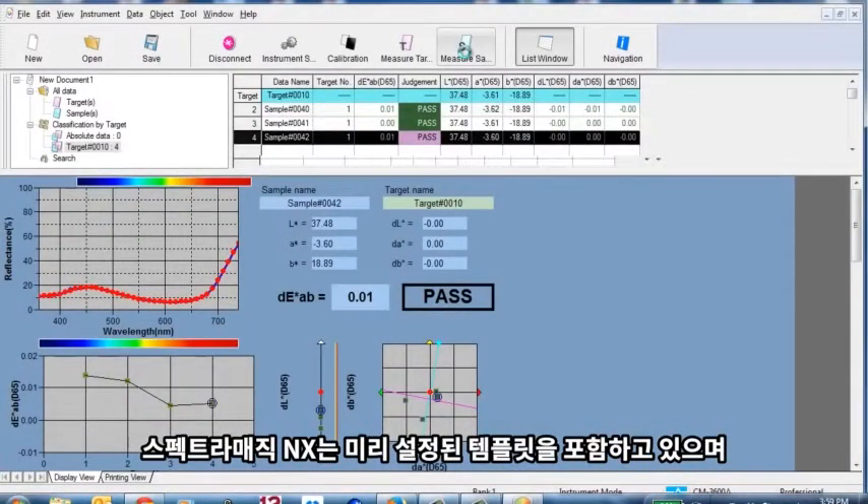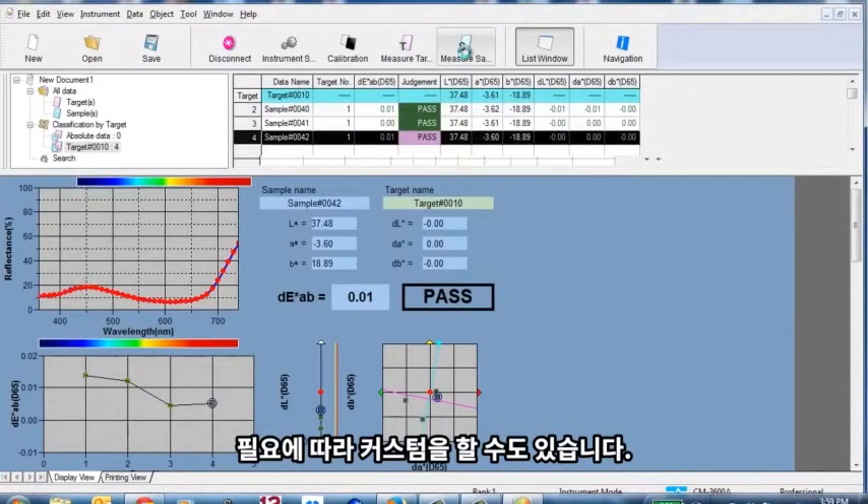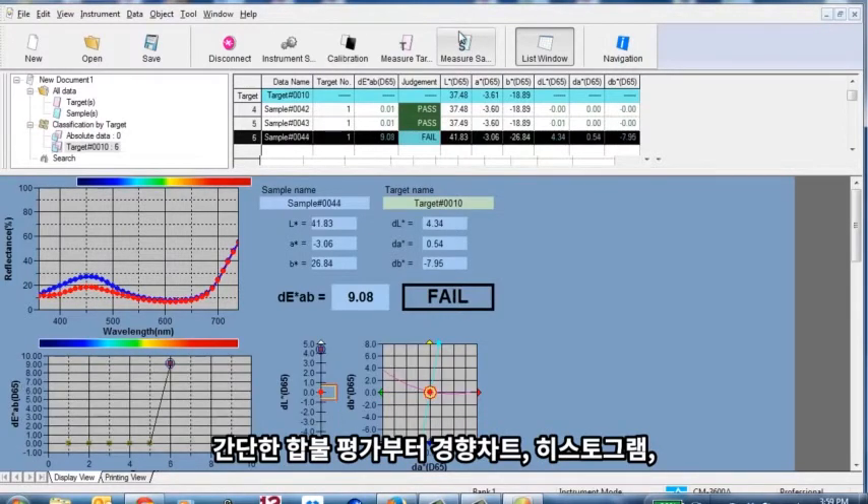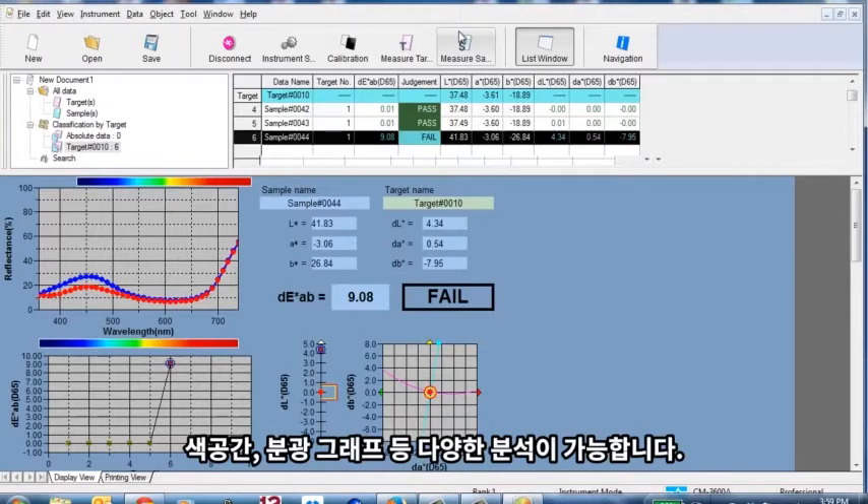SpectraMagic NX comes with predefined templates, or templates can be customized. Reports range from simple pass-fail to trend charts, histograms, color plots, and spectral graphs.